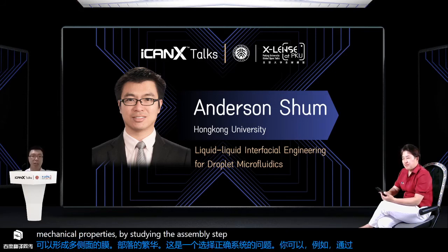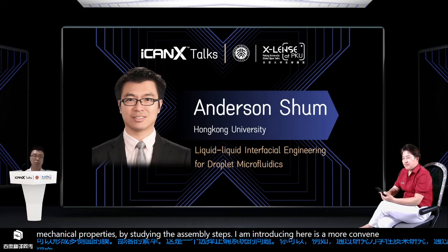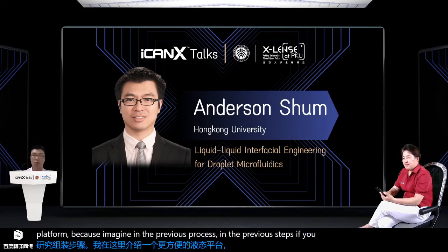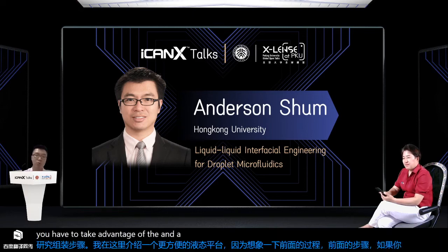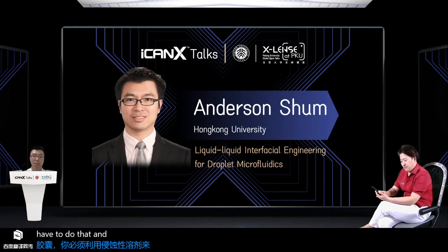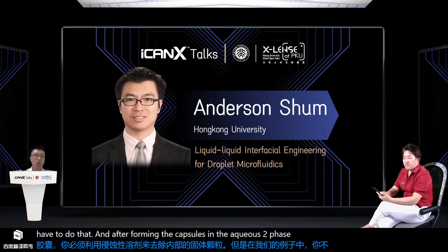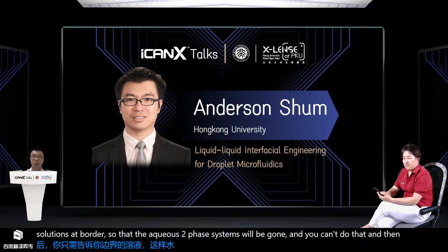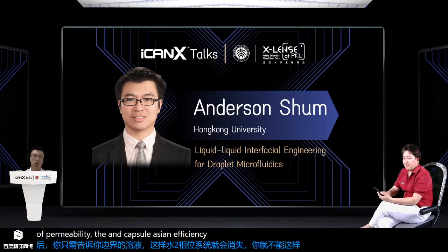All I am introducing here is a more convenient liquid-in-liquid platform. In the previous process, if you want to form the eventual capsules, you have to use an aggressive solvent to remove the inner solid particles. But in our case, you don't have to do that. After forming the capsules in the aqueous two-phase system, you can just dilute the solutions, add water, so that the aqueous two-phase system will be gone. In the end, the permeability and the encapsulation efficiency will depend on the choice of polyelectrolyte combinations that form the capsules.